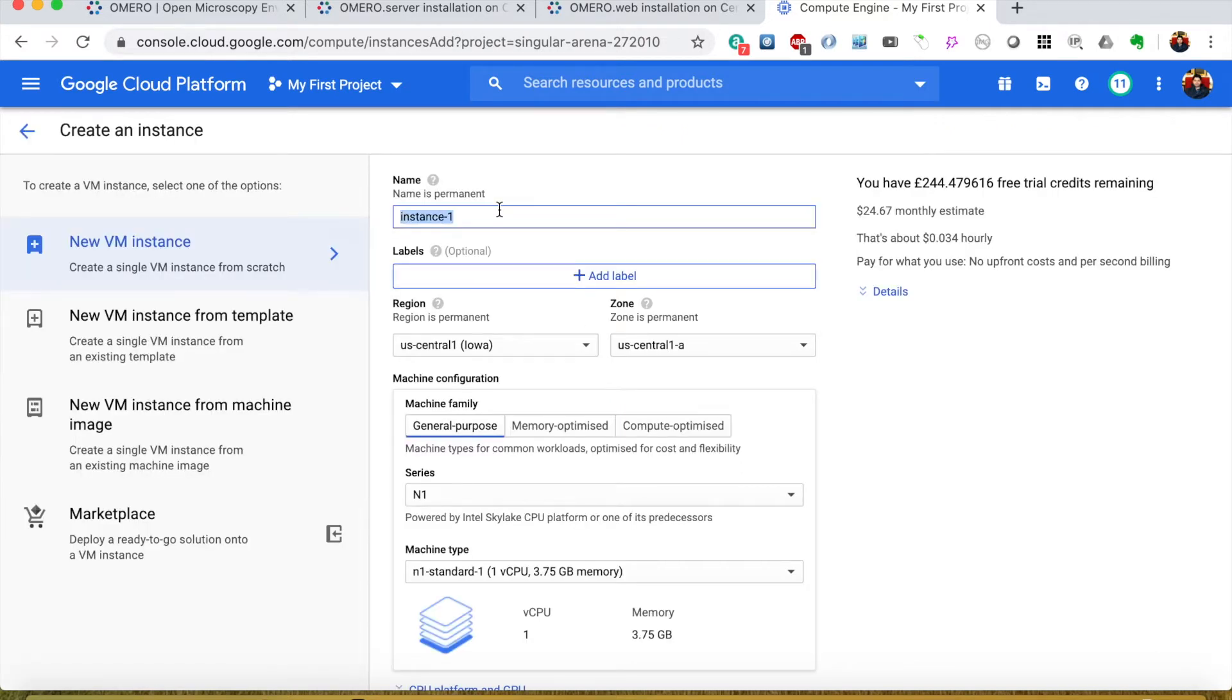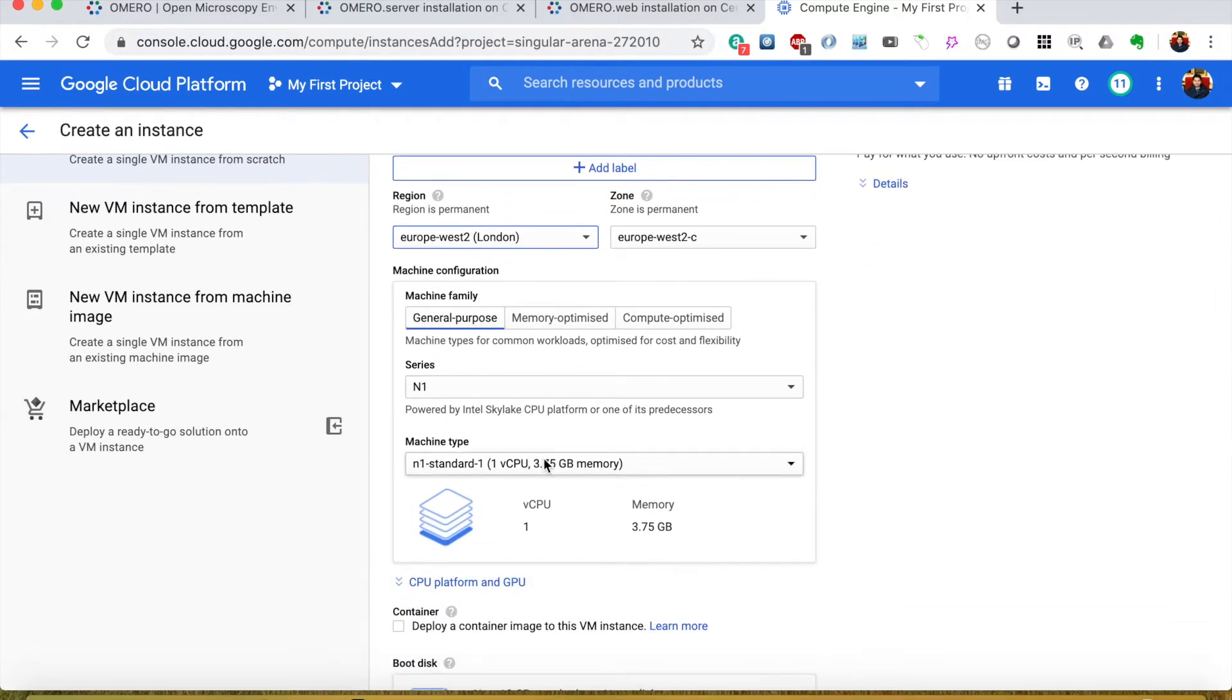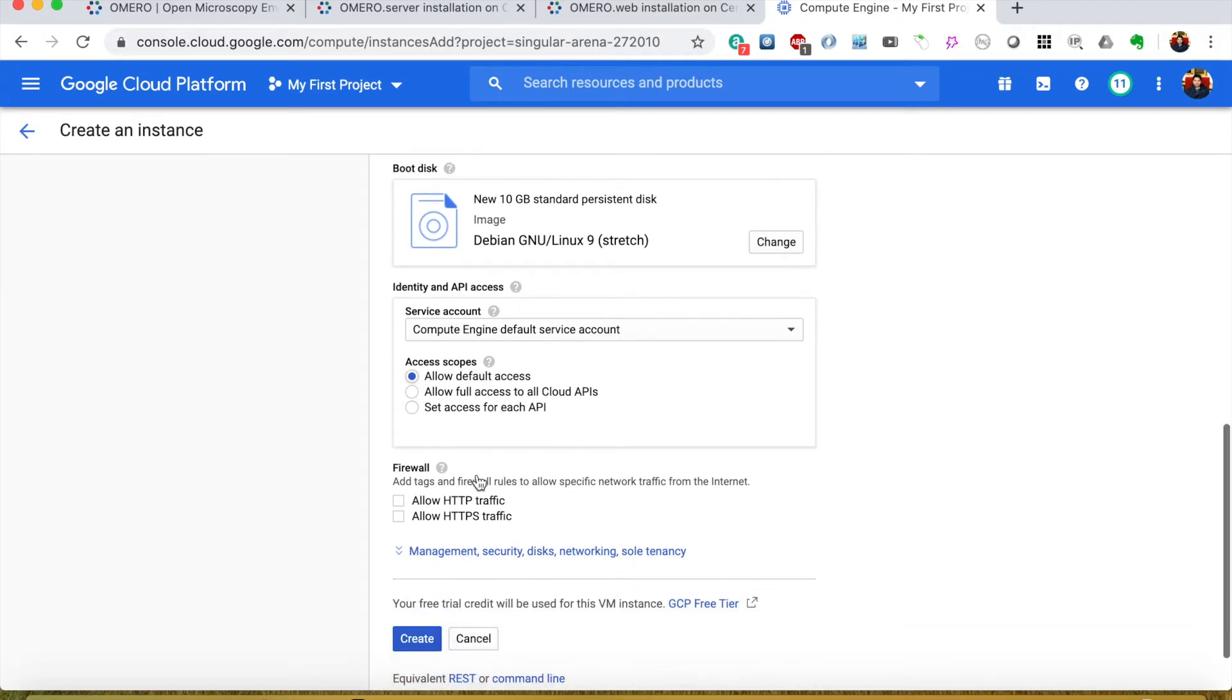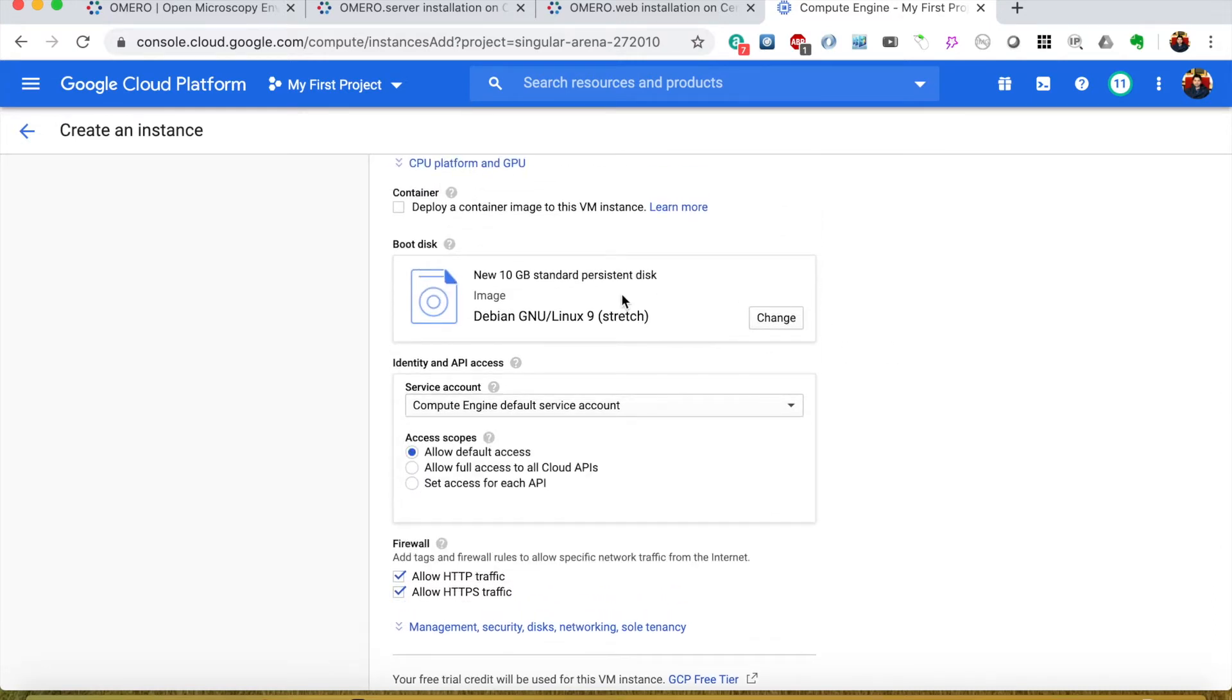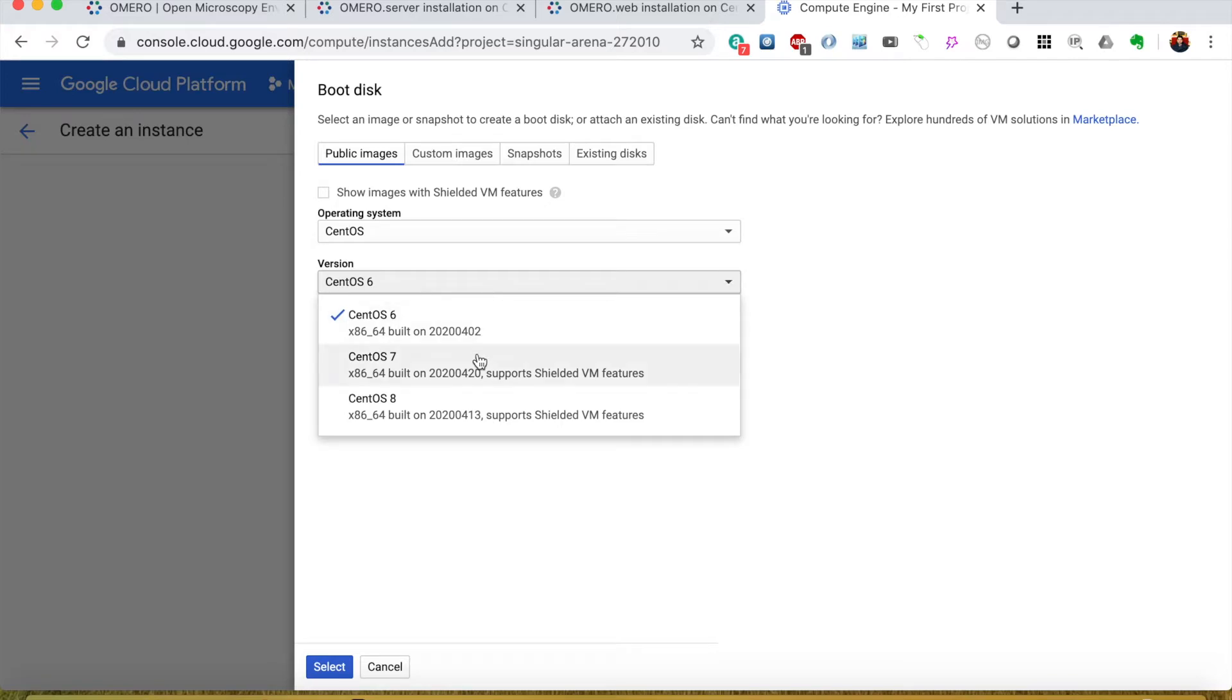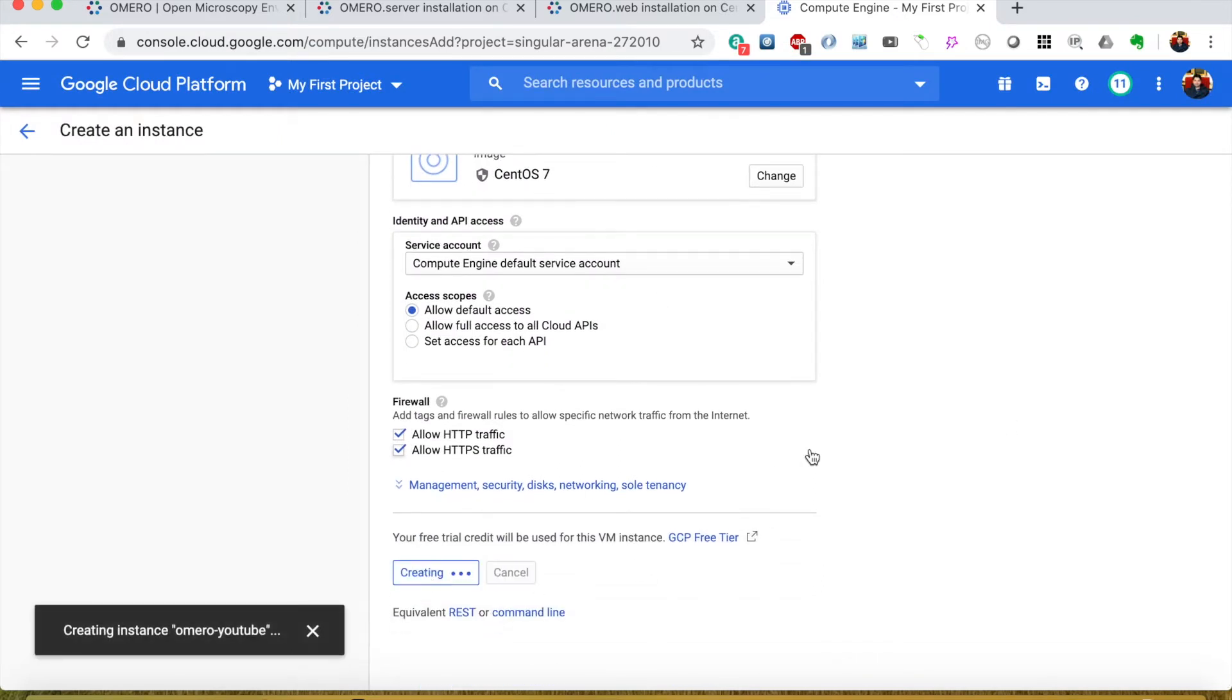You can name the instance as OMERO YouTube. I am in London so I will select London. The default is fine. I'll allow HTTP and HTTPS. I will select the image here. By default it's Debian, I will select CentOS and then from here I will select CentOS 7. 20 GB is fine, so let's click create.